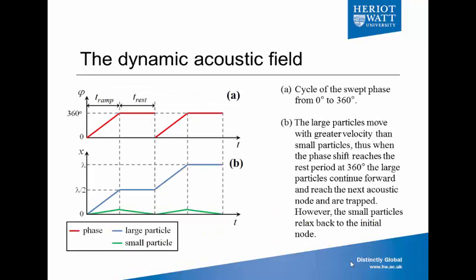So the idea is to develop a dynamic acoustic field where we can ramp the phase of one of the transducers, and the particle will move with the field.